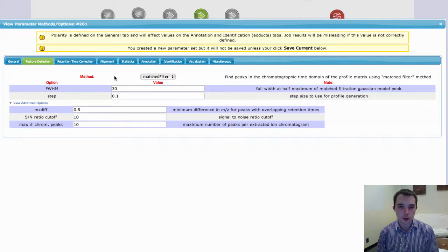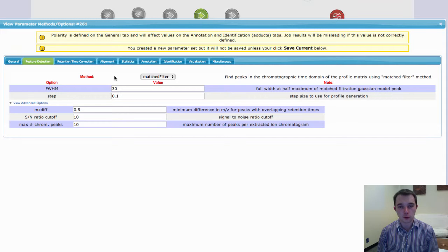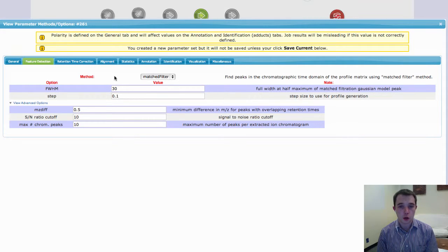One is MatchFilter, this is the original algorithm which was published with XCMS, and CentWave, which was an updated high resolution peak detection algorithm.